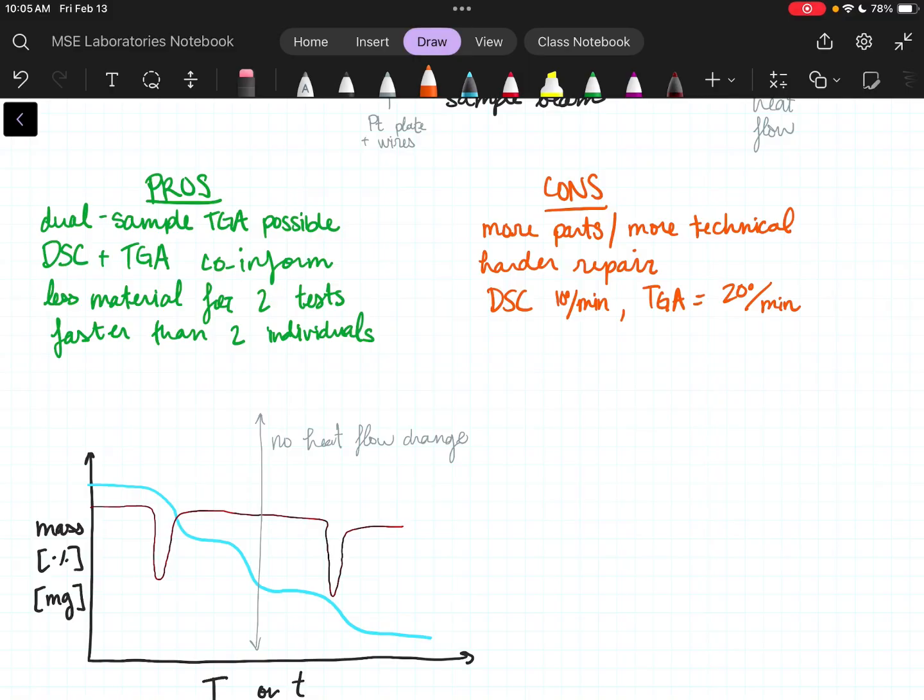I'm assuming that you have to wait for heat to flow into the thermocouple to be able to sense it, compared to, oh, you're just detecting mass, you can full throttle and we're taking 50 samples per second. Yes, 100 samples per second. There is definitely some consideration like thermodynamics and kinetics, and I talk through that in the DSC explainer. But there's absolutely some considerations where DSC, if you're going too fast, kind of delays the onset of some things working.